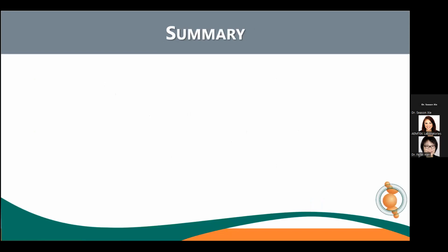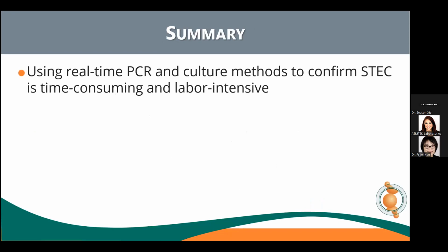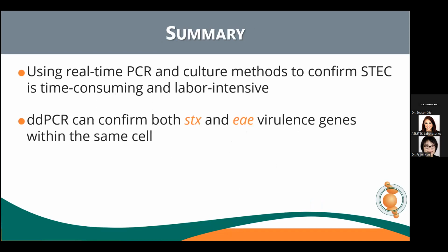In summary, today's webinar shed light on the challenge posed by traditional methods such as real-time PCR and culture for confirming STEC. These methods are time-consuming and may not provide insight into the co-localization of important virulence genes. However, a game-changing technology, ddPCR, was introduced as a solution. ddPCR enabled the confirmation of both STX and EAE genes within the same bacterial cell.